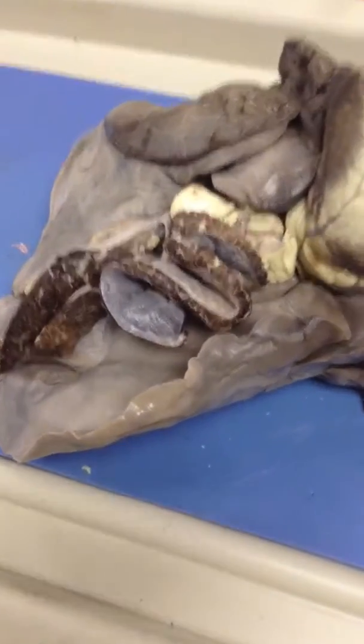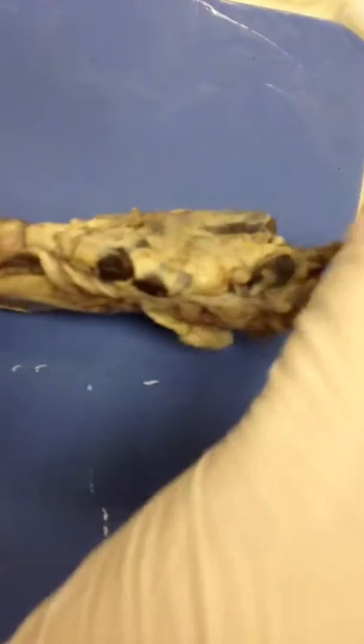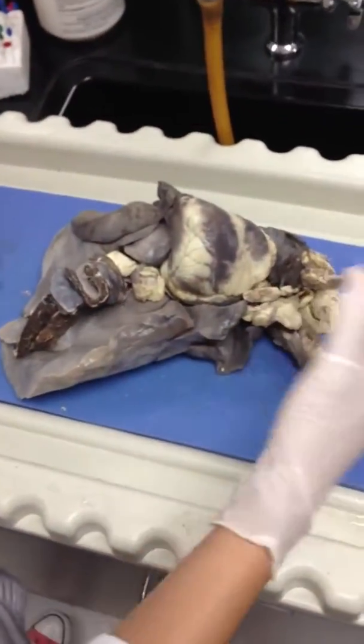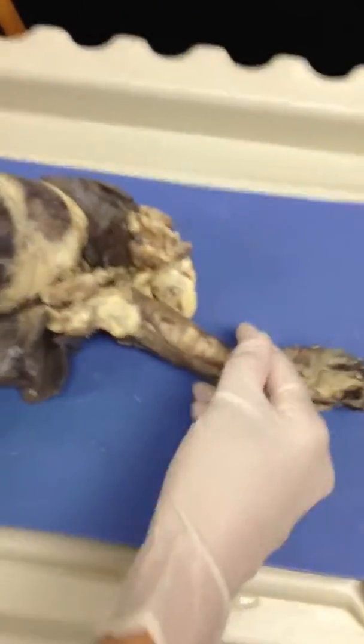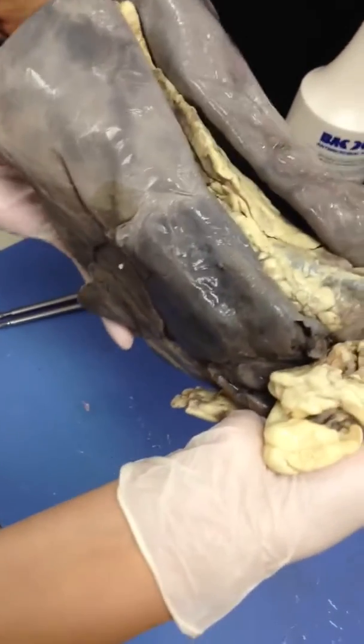This is a sheep pluck. Everything from the trachea where the sheep's head would be up here, down to the diaphragm, is what's included in the sheep pluck. Right now we're looking at the ventral portion — if the sheep were laying down, its legs would be standing up. If we turn it over, this is the posterior or dorsal side. It looks like a stingray. This is when the sheep would be standing on all four legs.